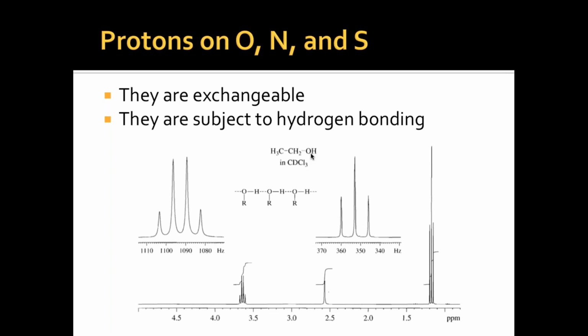So the relaxation is low. What that means is that they are not in the influence of coupling. They are not participating in the coupling. That's the reason you see a singlet. The peak coming from the OH is a singlet, because the OH hydrogen is not having any coupling, because it is in hydrogen bonding.